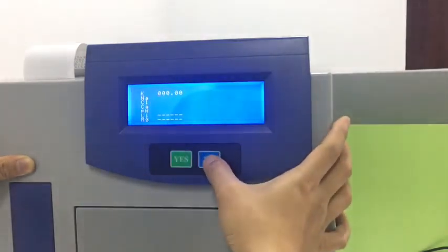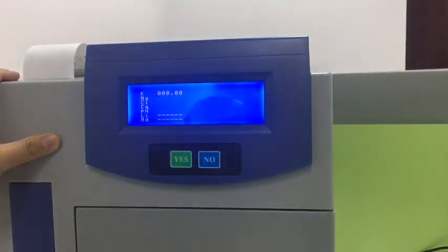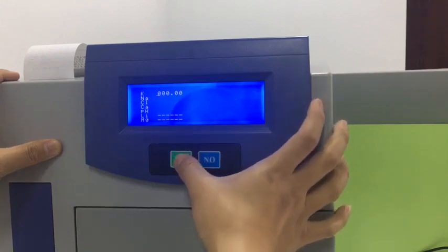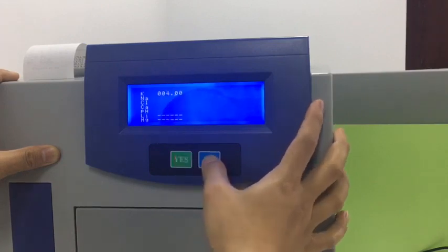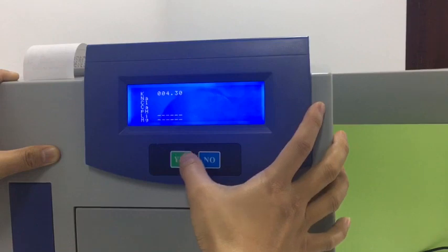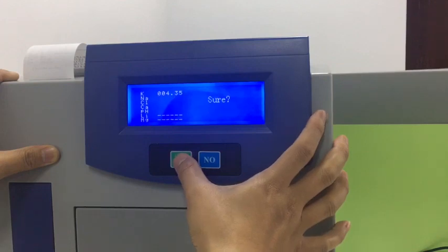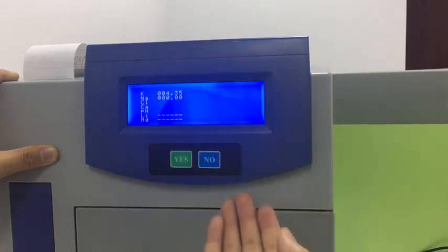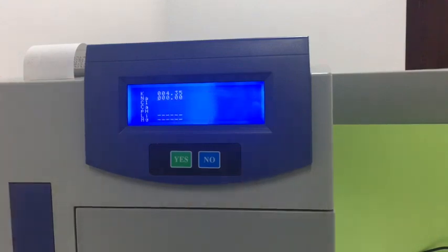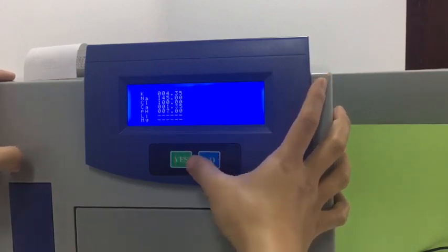Here we press 'No' to change numbers and press 'Yes' to confirm each digit value. We press 'No' to change to the third digit and press 'Yes' to confirm. We change other parameters using the same way to set all values, until we are done setting the target value.